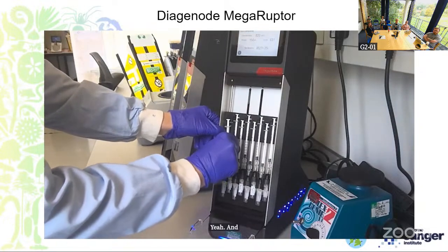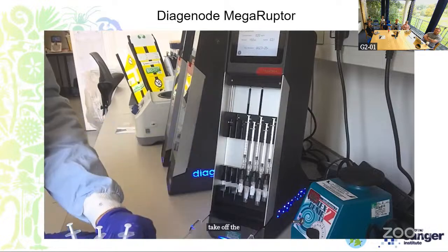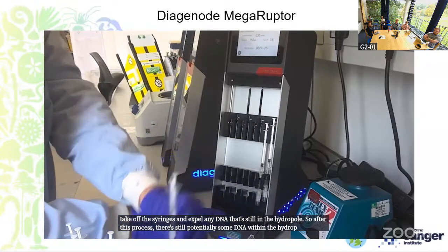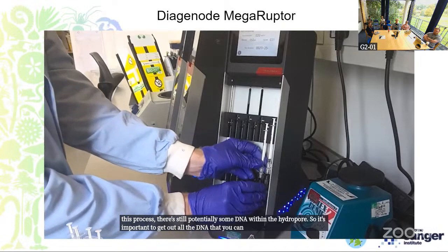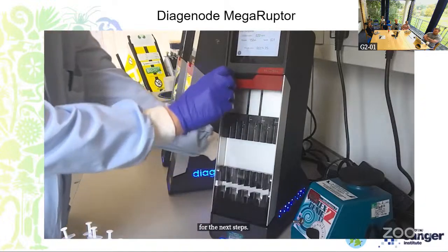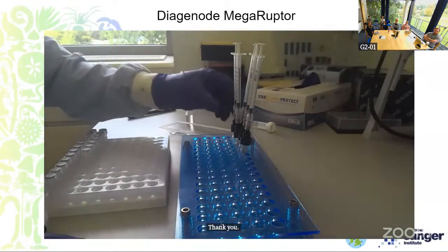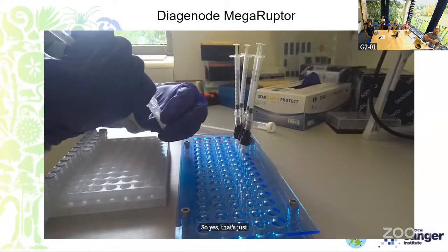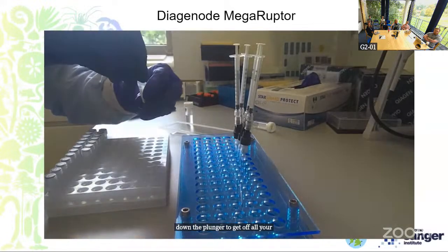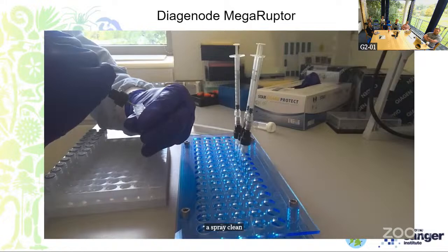Once the run is finished, we pop out the samples, take off the syringes, and expel any DNA that's still in the hydropore. After this process, there's still potentially some DNA within the hydropore, so it's important to get out all the DNA that you can and push the plunger down so that you keep as much DNA as possible for the next steps. This part of the video demonstrates that: pop off the syringe and squeeze down the plunger to get all your DNA. Pop the lid back on, and this is now ready for a SPRI cleanup, which we'll show you in a couple of videos' time.